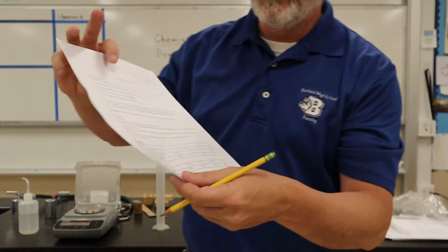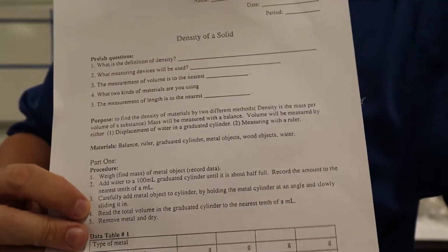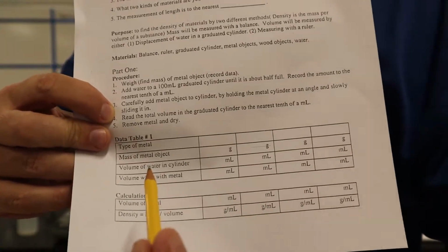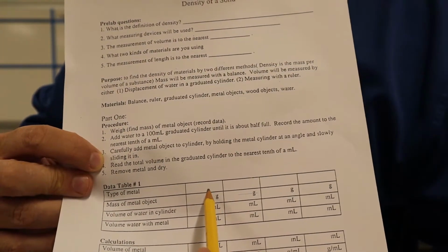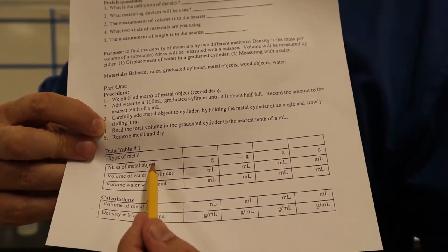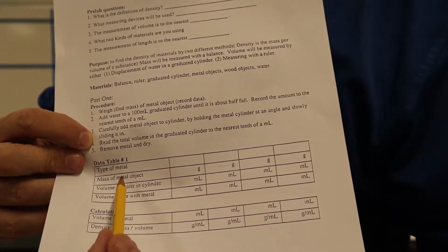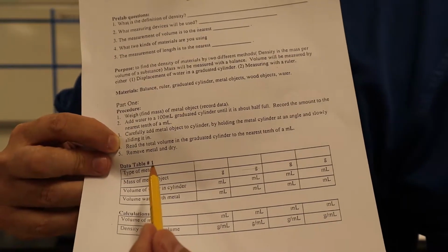So what we're going to do real quick is right here. This is the data table for the metals. You can see right here it says mass of metal object. So we're just going to weigh the metal objects, and then we're going to get the volume by something called water displacement. You probably remember that from 8th grade.